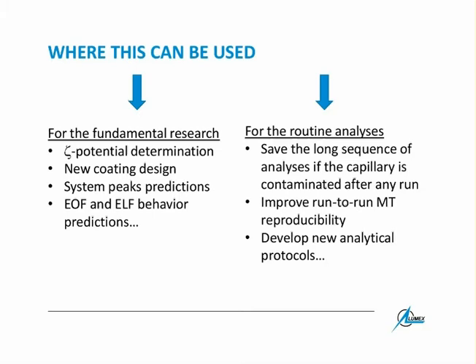Another question is coming. If you use such a powerful mode of capillary electrophoresis, which is called capillary gel electrophoresis, which is used for analysis of proteins. In this case, it is a kind of replacement for the very well-known SDS-PAGE, SDS polyacrylamide gel electrophoresis on a slab gel.